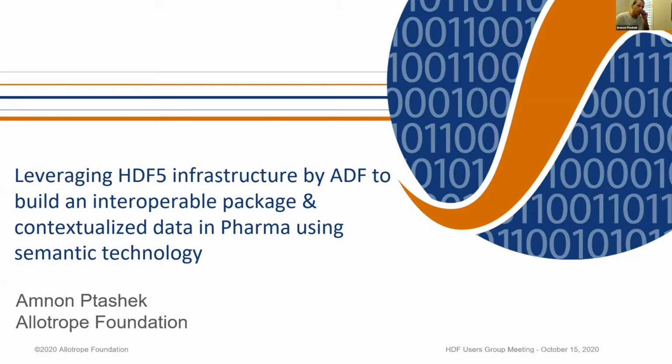My name is Amnon Ptashek, and I'm a member of the Allotrope product team. Just in an elevator pitch, Allotrope is a consortium of pharma companies. Most of the major pharma companies are members of our community, including some partner vendors. In the following presentation, I will be talking about how the ADF file format, Allotrope Data Framework file format, leverages the HDF5 infrastructure to create an interoperable and contextualized data infrastructure.